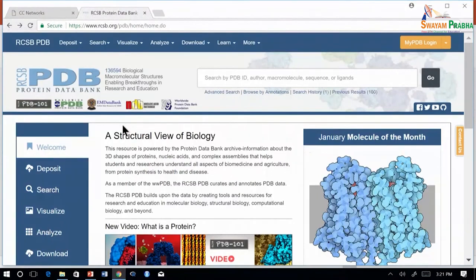The PDB or protein data bank is maintained by the research collaboratory for structural bioinformatics or RCSB. The structures are stored in terms of atom coordinates. Each structure is given a unique PDB ID consisting of a numeral and three alphanumeric characters such as 2LZM or 1A4Y. PDB is freely accessible to the public. We will learn about the PDB and how to navigate the website in the following demo.